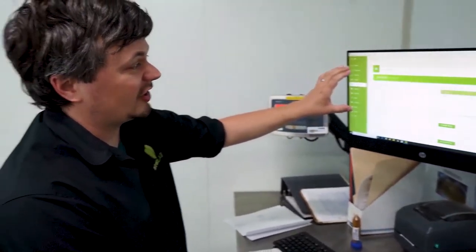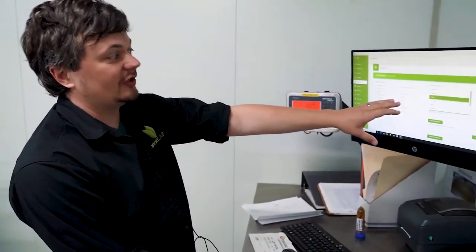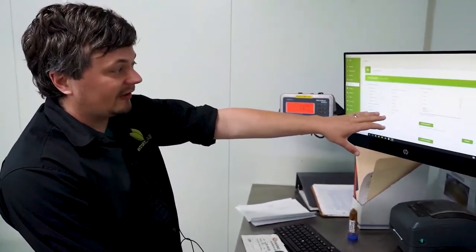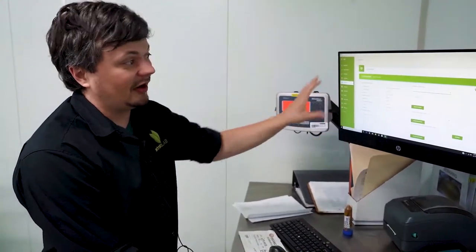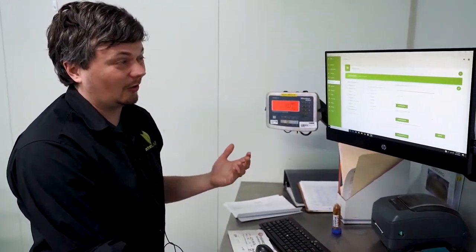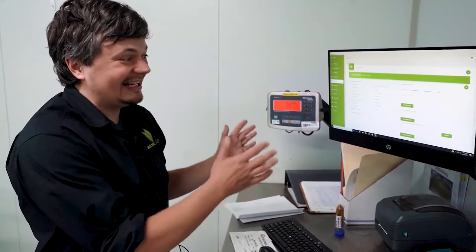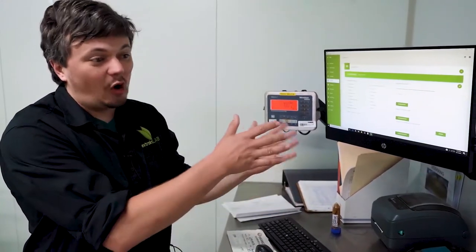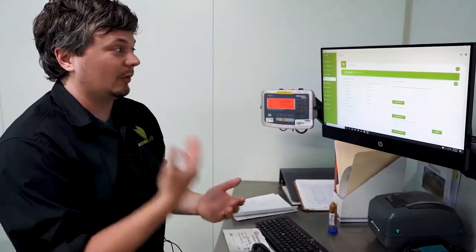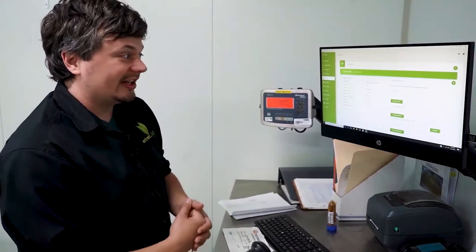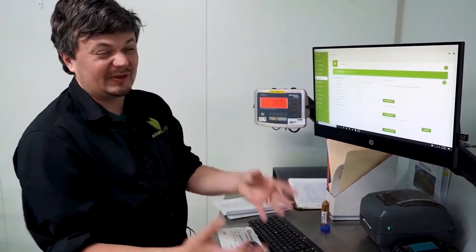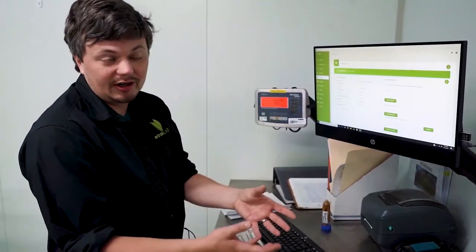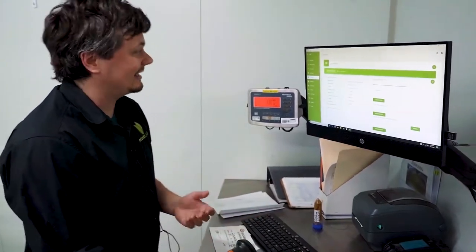So you can register cleaning events, inspection events, repaired events. All of this stuff is very useful for, say, keeping an organic certification. Because at an instant, you can get all the records of your equipment. You can see when it was last cleaned, what material it's been used by. You can assign equipment to a specific user if you wanted to assign tasks.